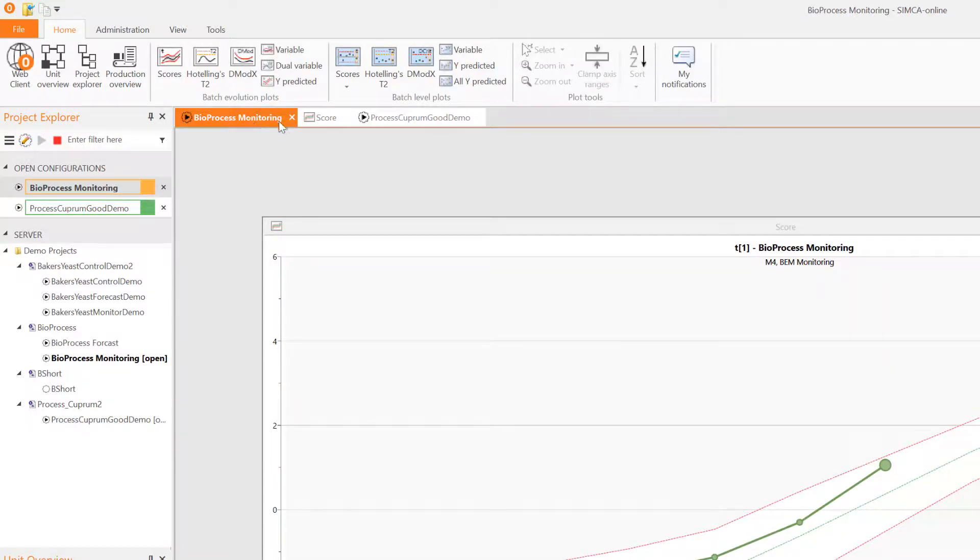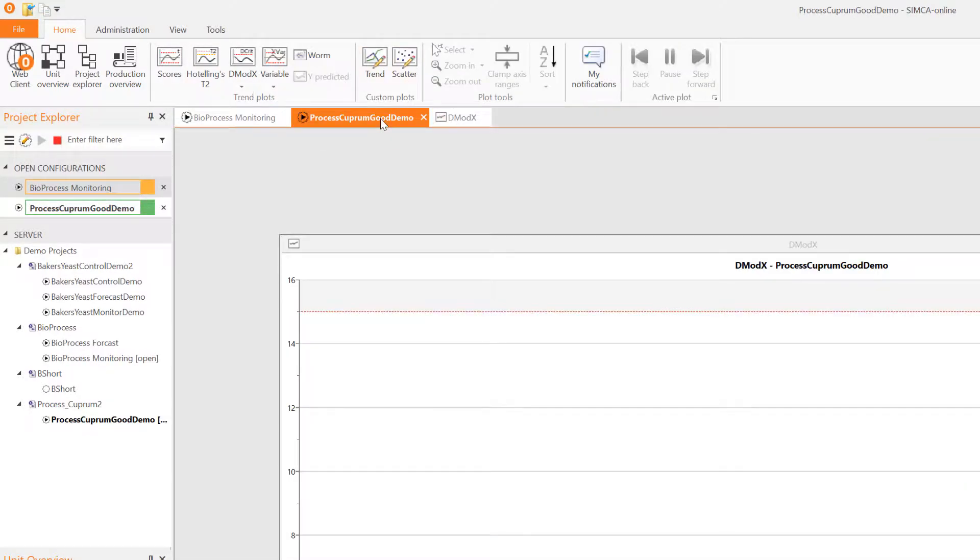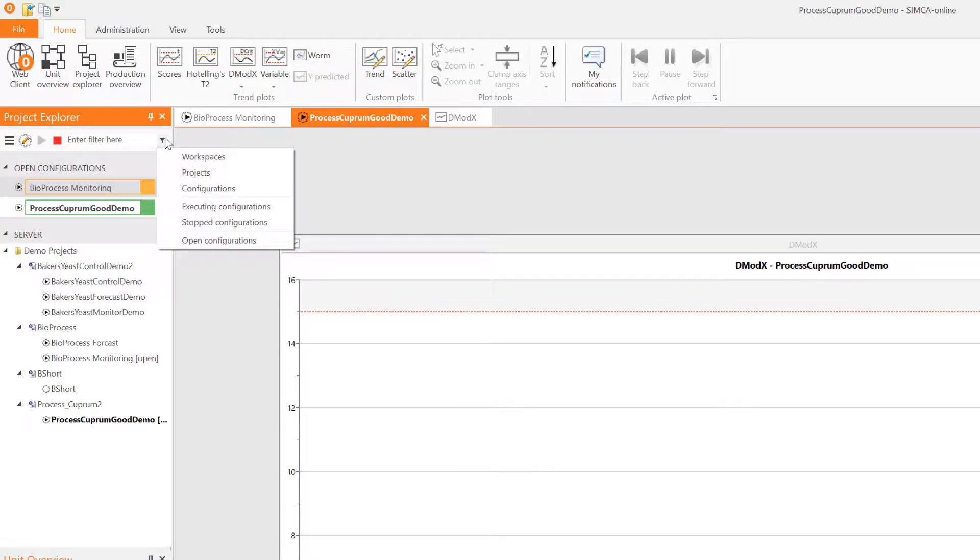Each configuration has its own tab in the tab control that allows you to switch regardless of the project explorer pane is visible or not.